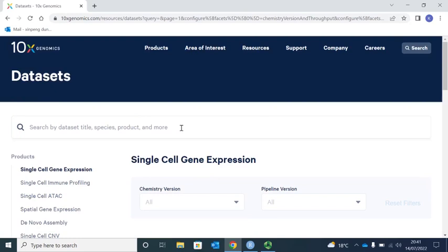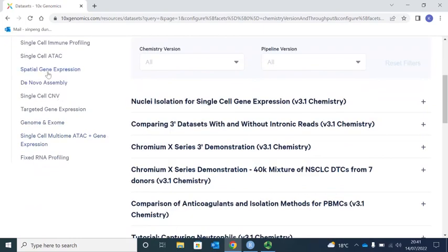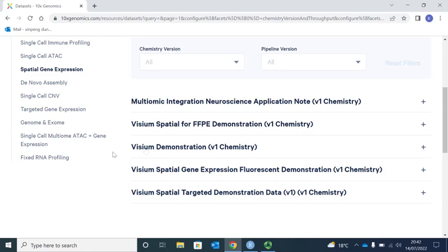If we press Dataset, you can see the link for Spatial Gene Expression. If we press the link for Spatial Gene Expression, we can see five sections for spatial gene expression datasets. The data I'm using today for demonstration was stored in the third section — Visium Demonstration, V1 Chemistry. Let's press the link.